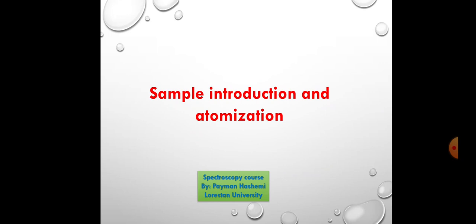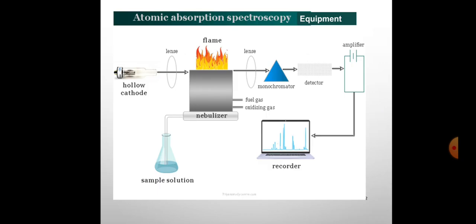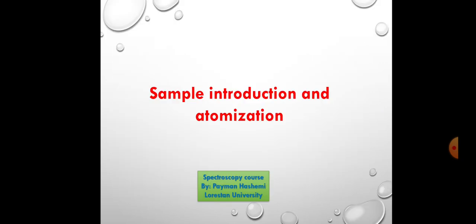In this chapter, or in this section, we are going to talk about methods of sample introduction and atomization.